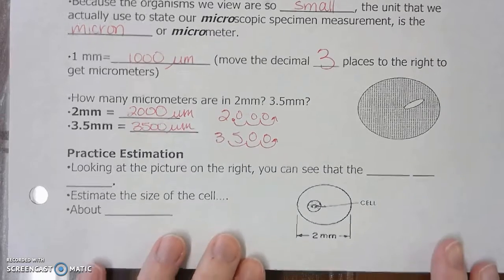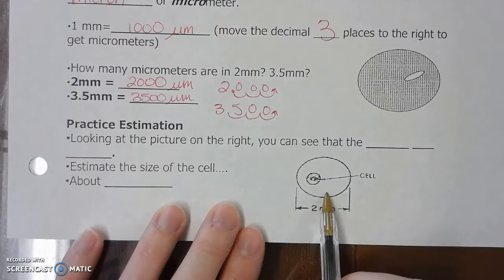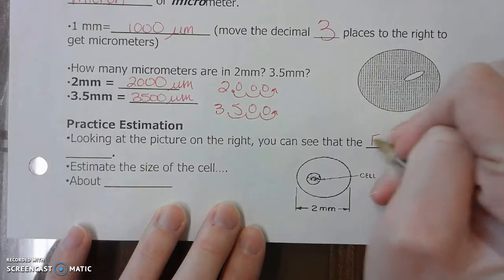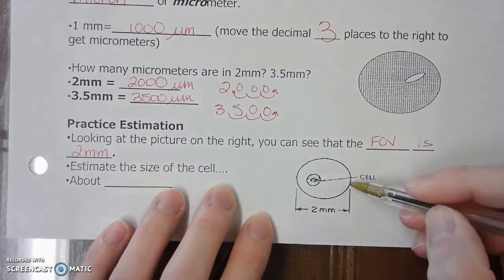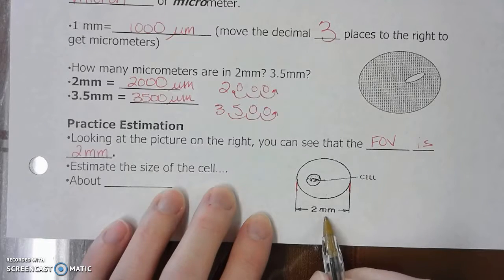On the bottom here, we're going to practice estimating the size. Looking at the picture on the right, which is actually down here, you can see that the field of view is 2 millimeters. So FOV is 2 millimeters. It's telling you that from one side of the field of view to the other is 2 millimeters.